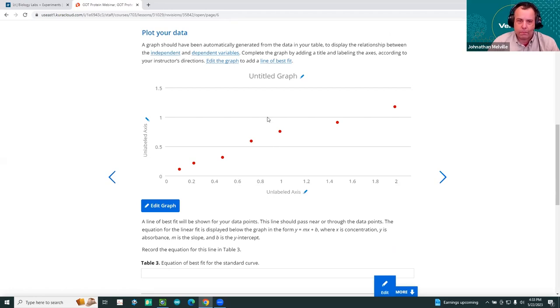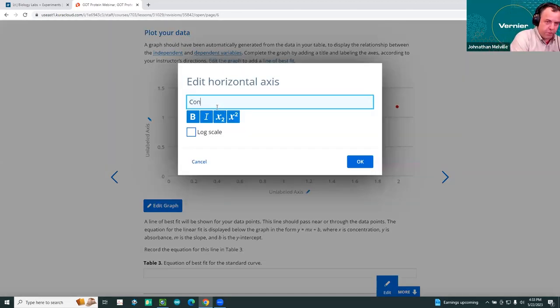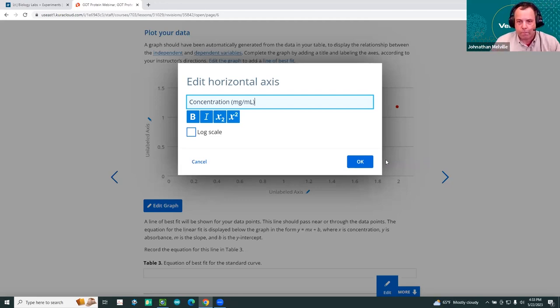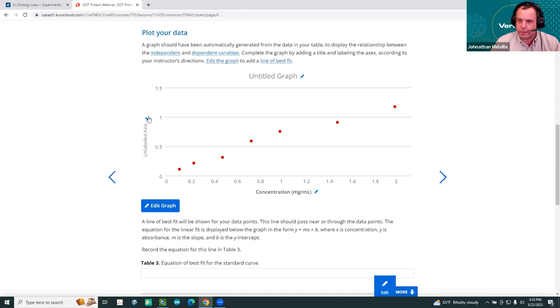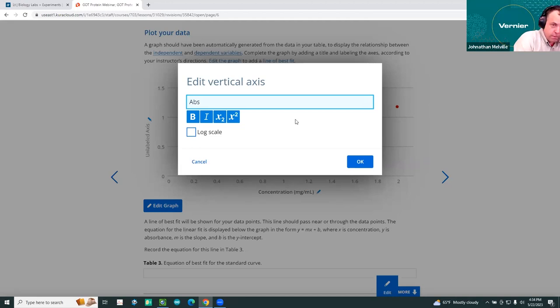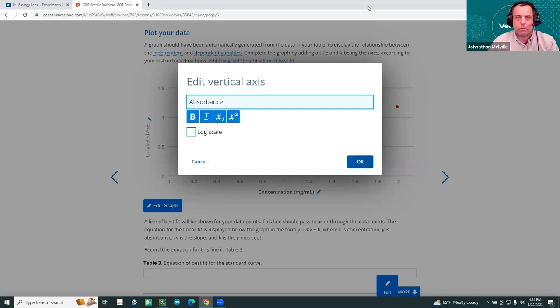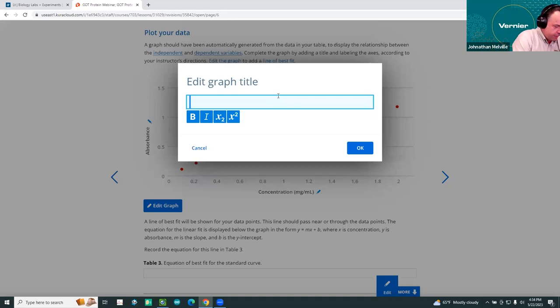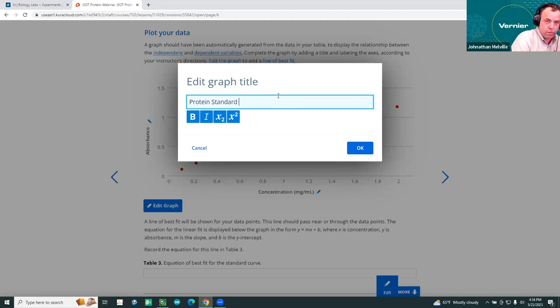I continue dragging each data point from the time-series graph down into the table: 1.5 mg/mL, then 1.0 mg/mL, and so on for the full series of standards.